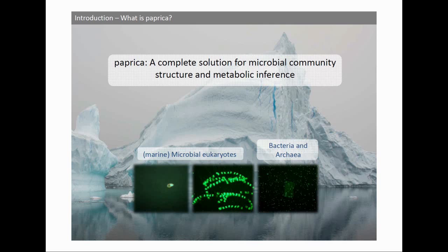Okay, thank you. So I'll give a little bit of an introduction, and I'll describe some of the methods, the PAPRICA technique that we use for metabolic inference. I'll then go into a practical tutorial on how to actually use PAPRICA to perform an analysis, and then I'll end with a little bit of a demonstration of some different applications for PAPRICA.